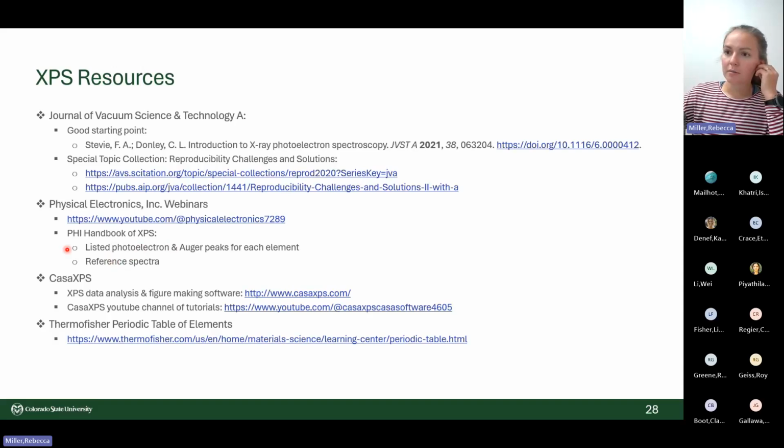There are really good webinars from the company that makes the XPS we have, Physical Electronics. So they have a YouTube channel. The handbook, as I've mentioned, all of our users have access to. And then CasaXPS is the software that we have a license for. Analyzing the data, it's really powerful. It's not always the easiest to learn, but they have their own YouTube channel as well with tutorials.